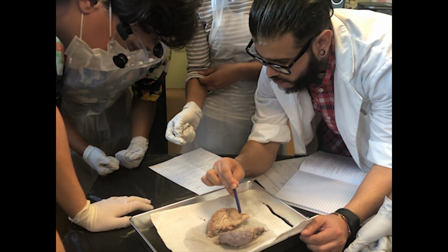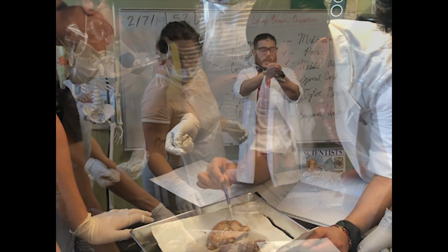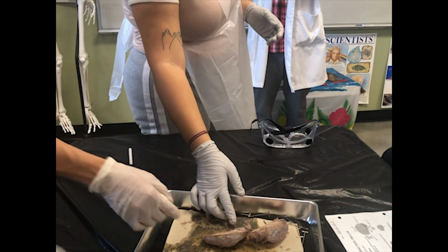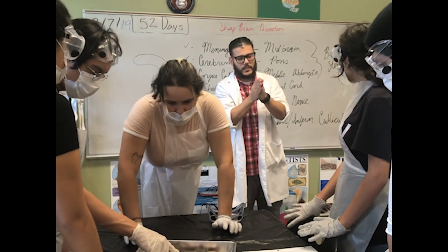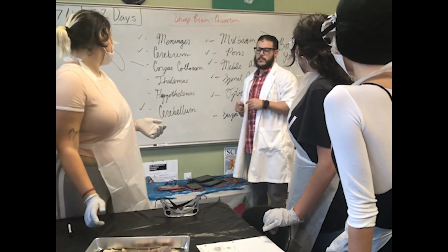You see the shape I'm going through? You see the one I drew on the board? That's right there. That's what we're looking at. Once you cut it, the corpus callosum now divides the brain into two hemispheres, and that's its main function. The corpus callosum allows for a transition between the left and right hemisphere, which then we talk about thalamus and hypothalamus, ladies and gentlemen.